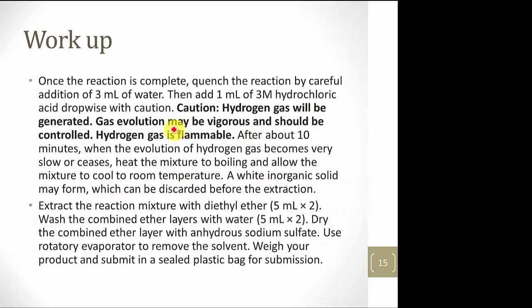So for the workup, once the reaction is complete, quench the reaction mixture by adding water. DI water is fine. You can use tap water, but we provide you with deionized water, so use that. Then we add 1 mL of 3 molar HCl dropwise with caution. Why?